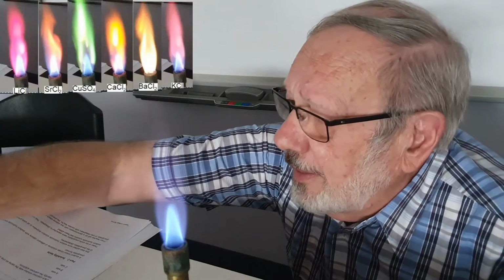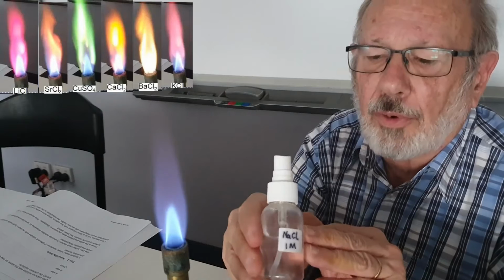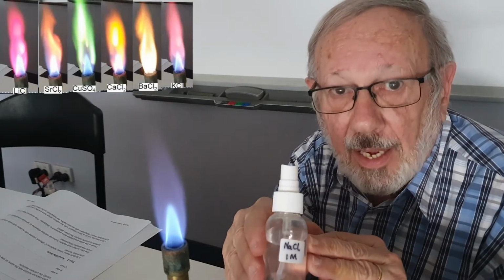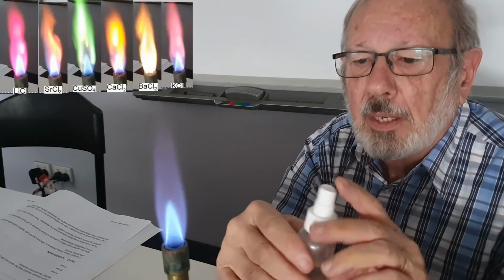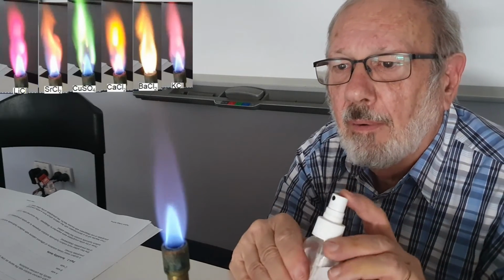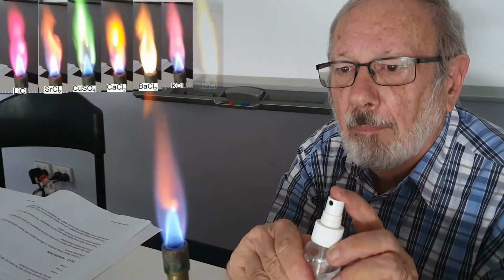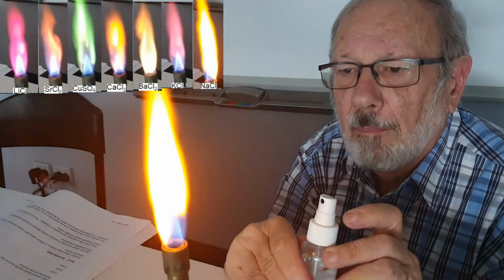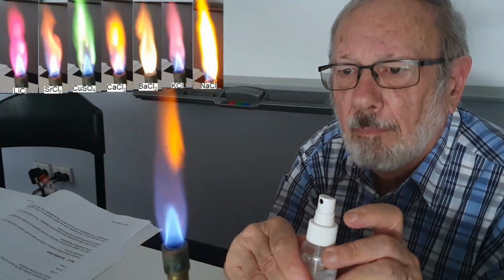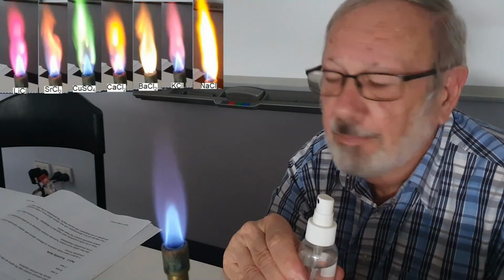The last one is sodium chloride, and its formula, as we probably know, is NaCl. I'm going to call that bright yellow.